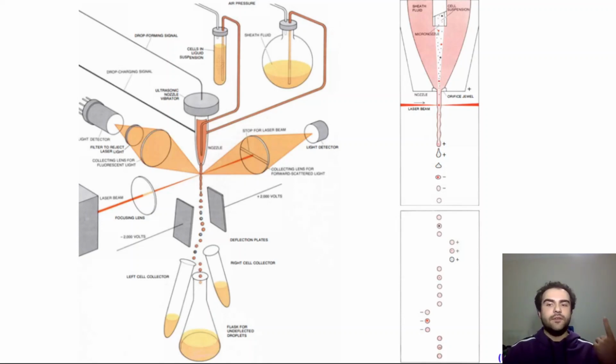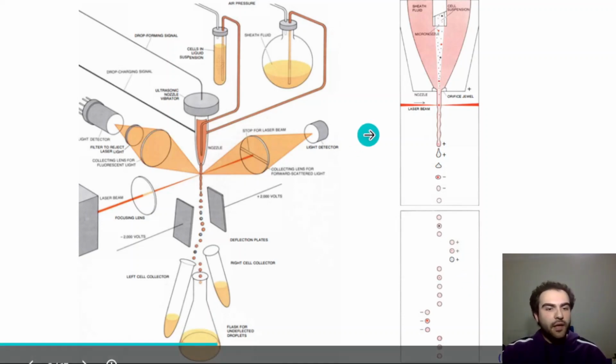One detector lines up with the light beam, and it's called forward scatter or FSC. Some are perpendicular to the cells, measuring side scatter, abbreviated as SSC, while other detectors measure fluorescence. The fluorescent chemicals may be inside the cells or attached to the surface of the cells or their envelopes, and they can be excited to emit light, which is captured by the detectors in our mechanism.